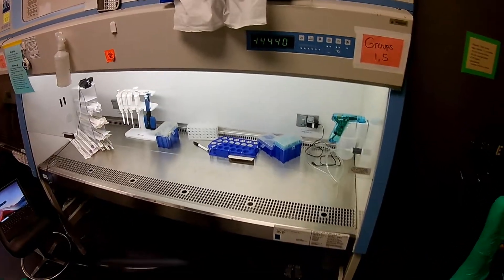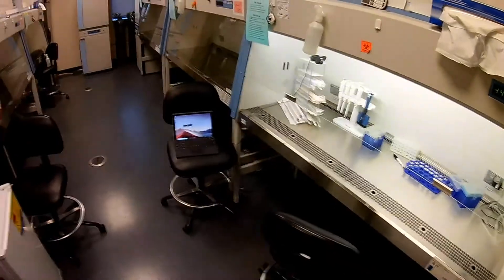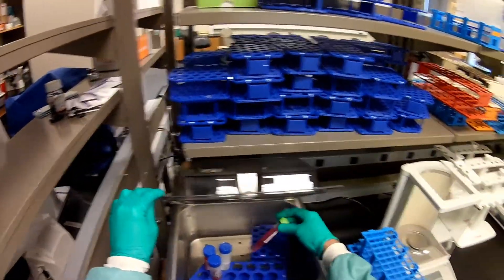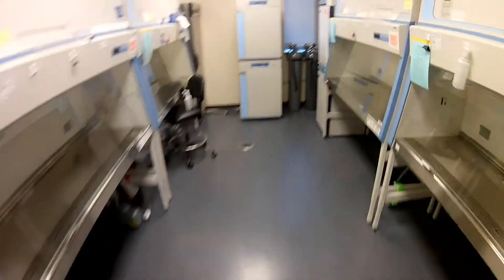I already have my stuff ready. I already have my biological safety cabinet up and working. I have media, PBS, and some trypsin thawing out in the water bath. So let's go first to the incubator and look at the cells.